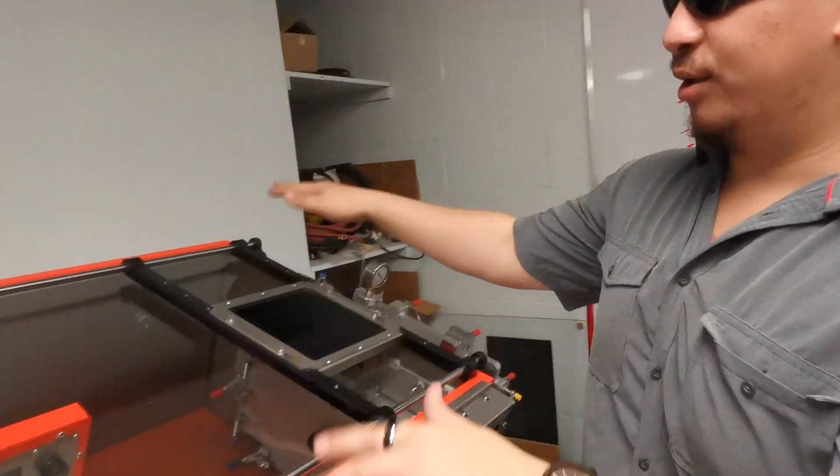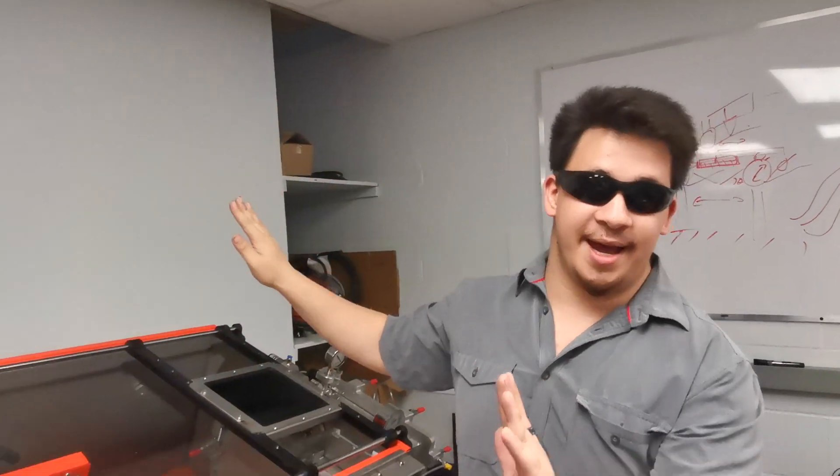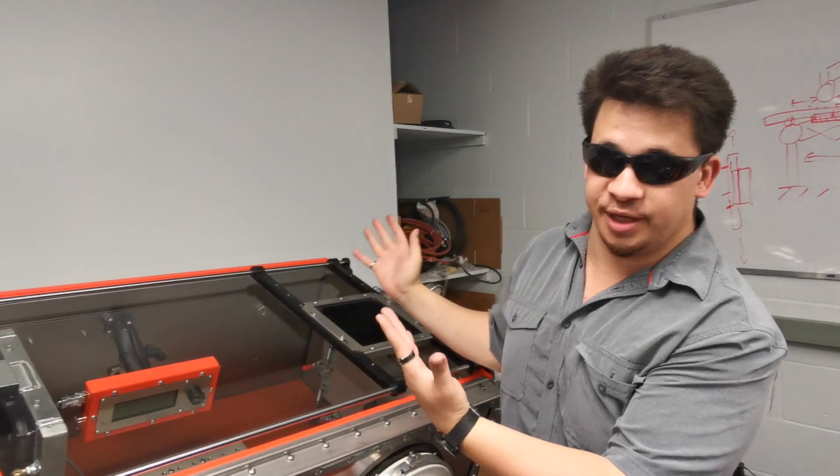The glove box tilts from flat up to essentially any angle that you want in order to add ergonomics for the user.